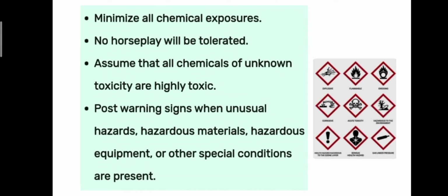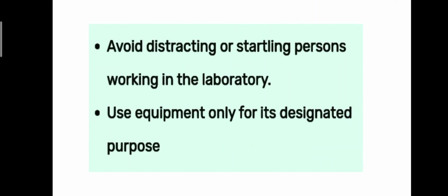Post warning signs when unusual hazardous materials, hazardous equipment, or other special conditions are present. Avoid distracting or startling persons working in the laboratory. Use equipment only for its designated purpose.